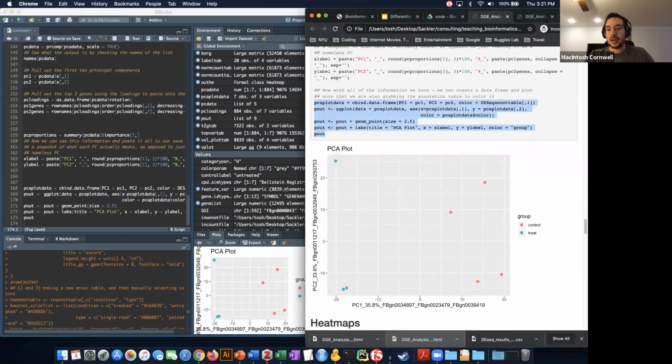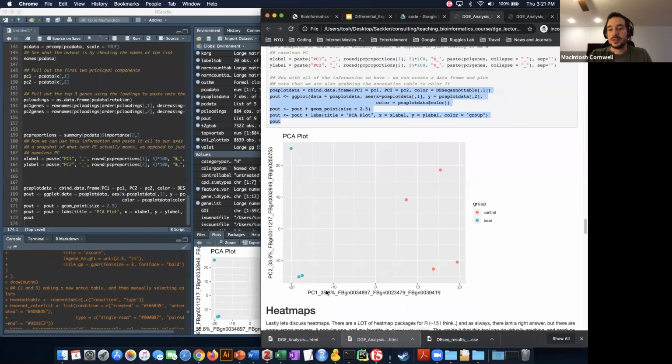And you'll see that this PCA plot, like all PCA plots, will be two principal components showing our samples in a two-dimensional space. But the addition of these extra things will help explain what's going on a little more. Specifically, by adding on the percents to these axes, you'll be able to explain how much variation is explained in each of these directions.